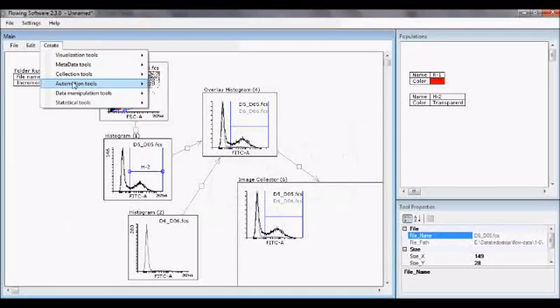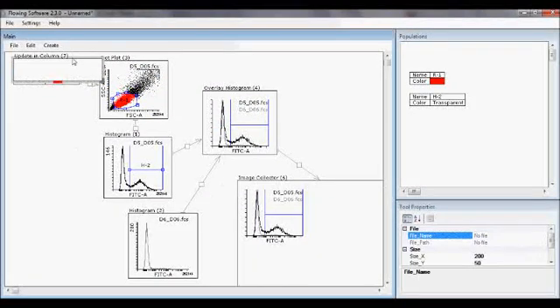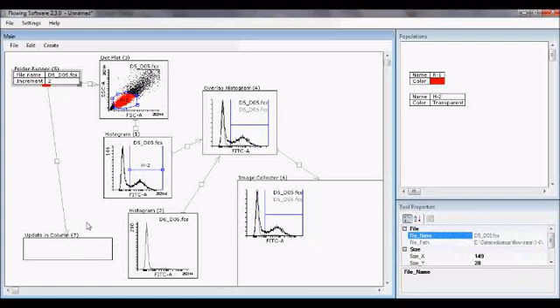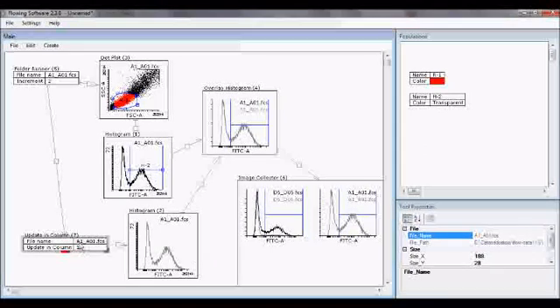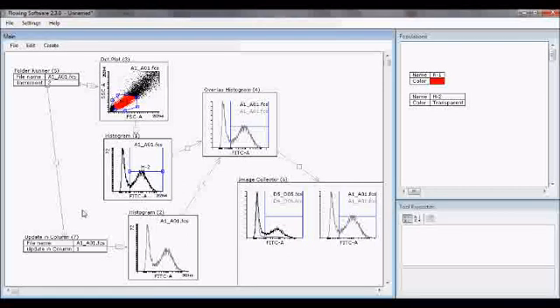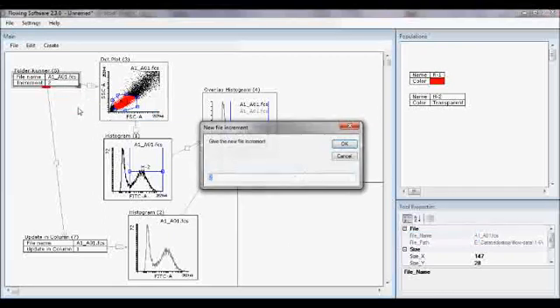Other way of using these are, for example, you might have some condition. For example, in column 1 you have always negative sample, so you can make the automation tool which updates only when column is 1. Of course, this assumes that you have run yourselves from well plate. And let's clear this. And now this overlay histogram is always the sample, and then as a background, this gray background, there is always the sample from column 1, and file increment is 1.